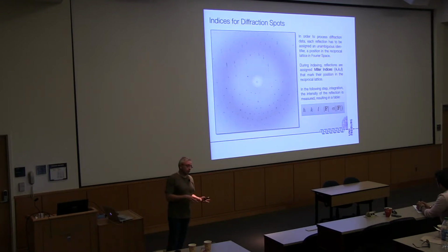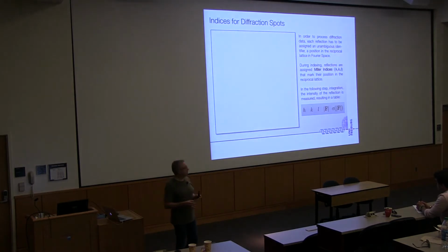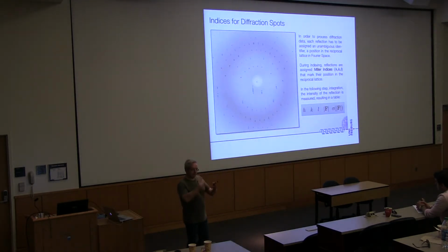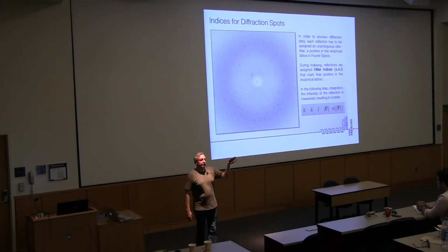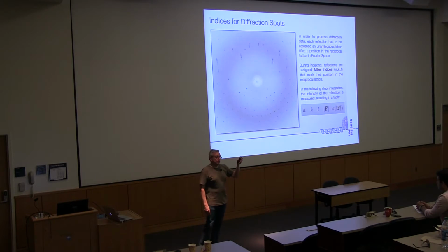And if we rotate the crystal, and you can do that in the practical, not rotate the crystal, but go through the diffraction images. You can also rotate the crystal, but it's kind of boring. Then you see that the diffraction image changes. So you rotate the crystal while you hit it with X-rays, and these little point patterns, they change. So we need to collect data at many different orientations to get different spots, to get different patterns.